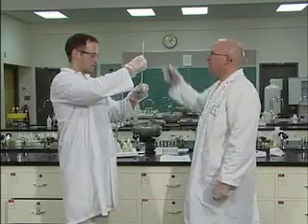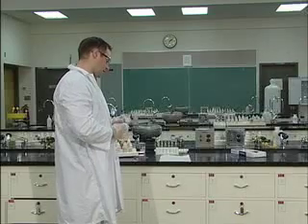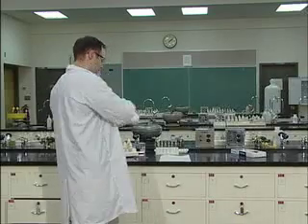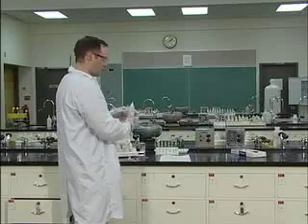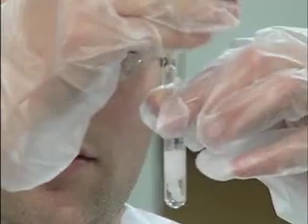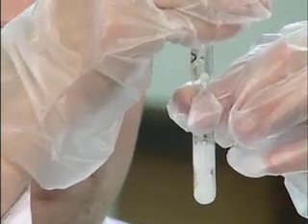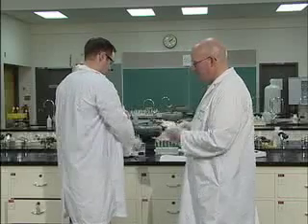Remove the thermometer, clean it. We're going to add to this 15 drops of barium nitrate. Now, judging by what you've seen so far, you should probably be able to figure out the barium nitrate is going to do something when you add it in here. Oh, I'm seeing precipitate happening. It's going all white. We get a white precipitate forming.